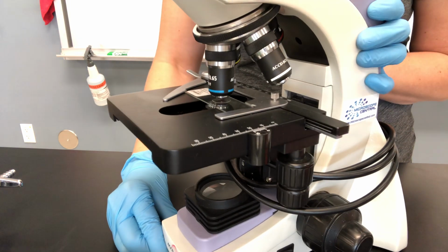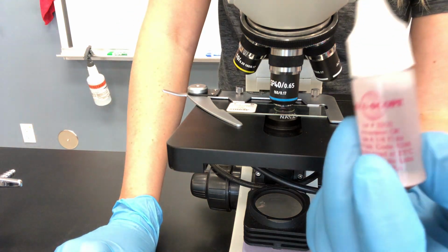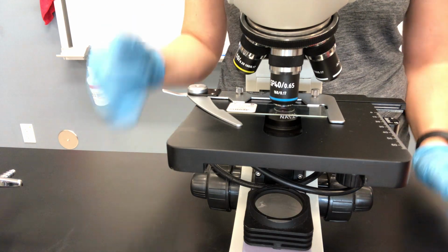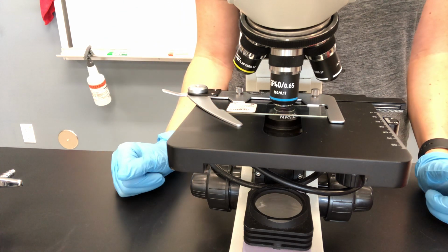So this is where I'm going to turn it a little bit more like this so you can see straight on. In microbiology, we use this immersion oil. It's this little container right here. What it does is it helps the immersion oil lens work. Without it, you can see stuff, but it's super blurry. The oil is what's going to make it focus and have a nice clear image.